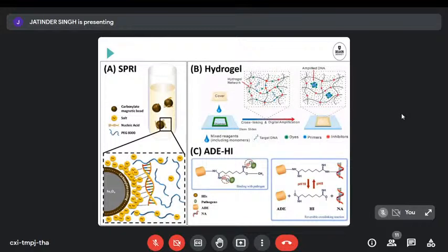Another thing, for those of you that are doing gel electrophoresis for your project, DNA can actually be quite effectively captured in a gel. So you can also use a hydrogel to retain the DNA whilst other compounds are being eluted away. So a cross-linked gel can also be used for the extraction and purification of DNA. A very nice feature in the article here is that they diffuse out the small molecules from the lysate, then infuse in reagents for amplification, and they could actually, within the gel network, do localized digital amplification of the DNA.